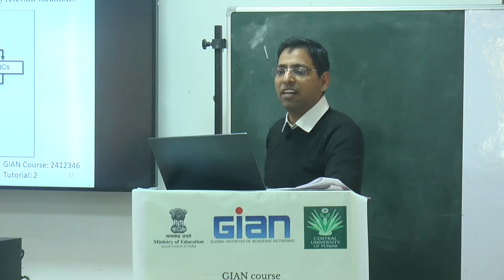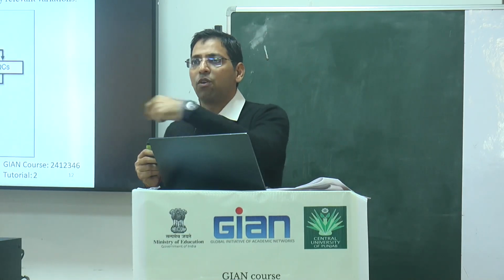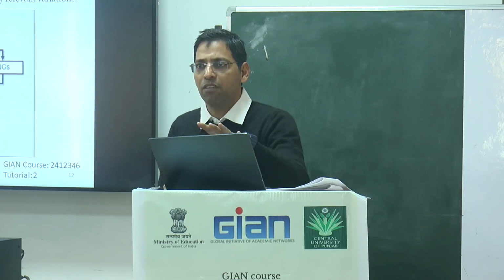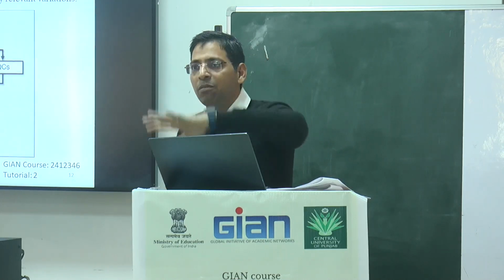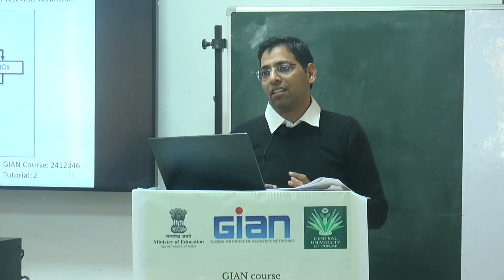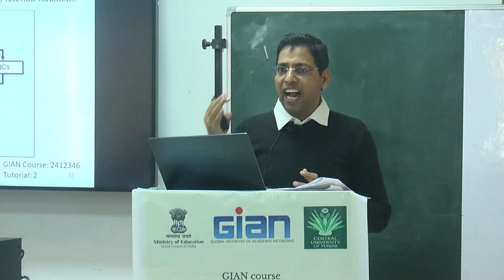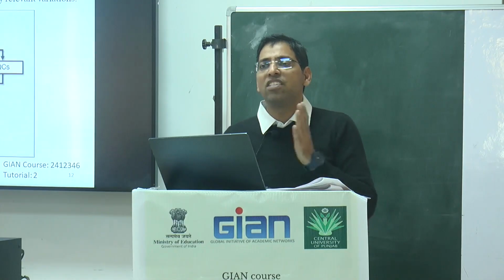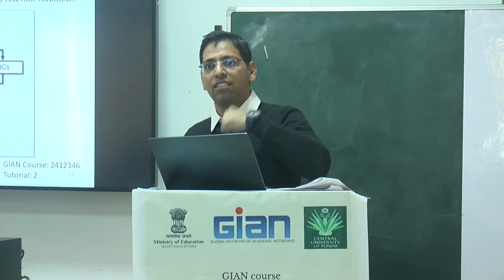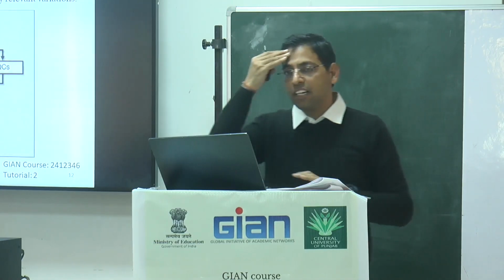The first one is the randomized sample order. Sometimes I have to start reading all of you from here, next time from there. I will count here, you are the 55th, and if I count from that end, it will be the 55th. So I can minimize the errors that happen during the counting of your sitting plan. That concept is labeled as randomized sample order. One time I analyze the samples from this end, the second time from that end up to here. So that is a randomized sample order.